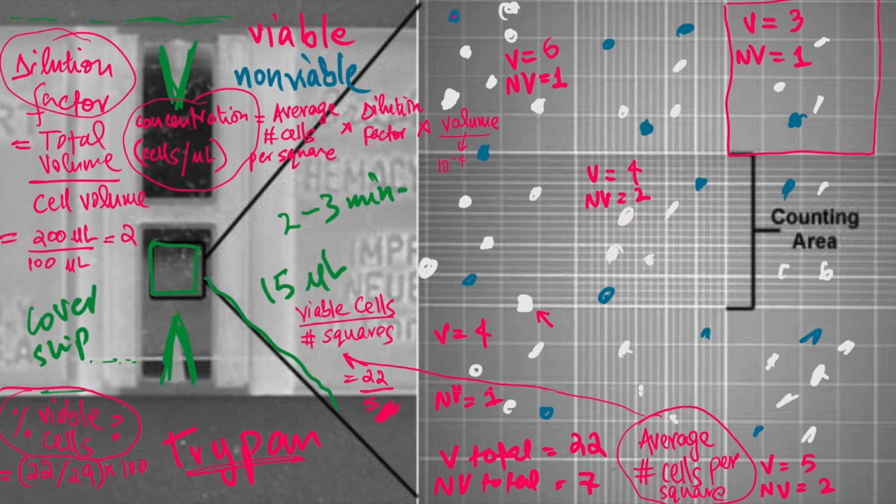The other important thing is sometimes the cells are deformed, and when they're deformed, their shape is more or less slightly disturbed, a bit arbitrary. So you really find it hard to classify them as a viable cell. So you might want to classify them as a deformed cell, and keep a separate count of them rather than counting them as viable cells. If they don't have a regular shape like the other viable cells, you might want to call them a deformed cell and keep a separate count of them.